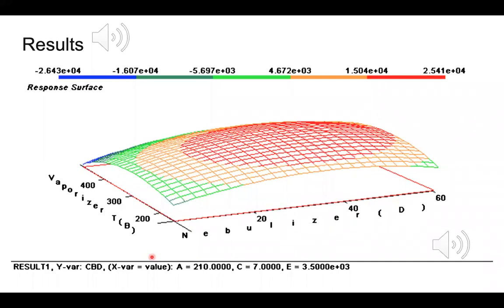They tried water or methanol with ammonium acetate, water or methanol with formic acid, and then water or methanol with both formic acid and ammonium acetate. And they ended up finding that the best option was the methanol or water with formic acid, particularly at 0.1% formic acid, since this provided the best conditions for separation of the target analytes. They decided this by taking into account which solvent provided the best peak shape and the best sensitivity.